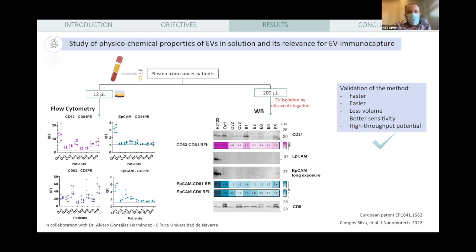Good. Okay, so these Western blots were basically coming from about 67, whatever microliters of original. 200 microliters. Yeah. Oh yeah, sorry, and then you were using about a third. Yeah, so that makes sense. All right, so thanks for that.